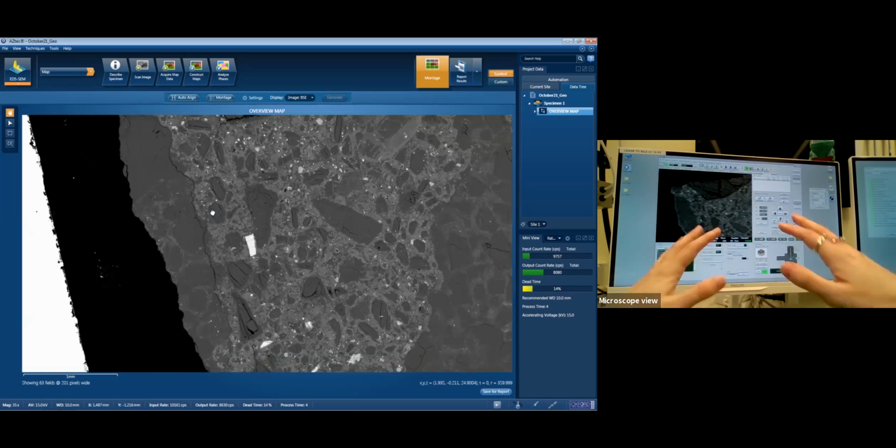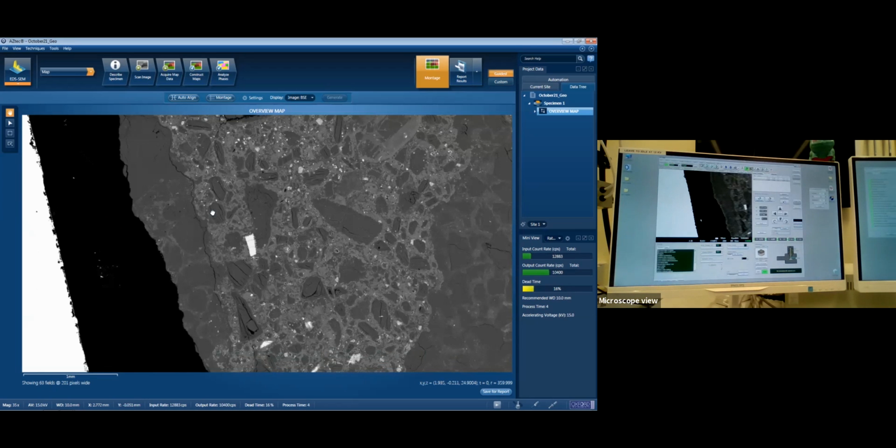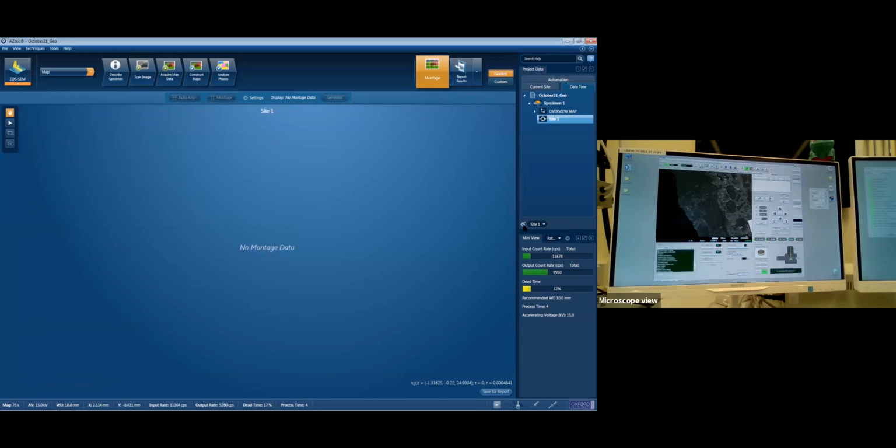So Lorelei is now going to find this on the microscope, and then we'll be able to start. Beautiful. So Lorelei finds it on the microscope. Beautiful. So let that load in on the microscope, and then what our computer does is it will pull it across into this software. And oh no, that was absolutely the wrong button.